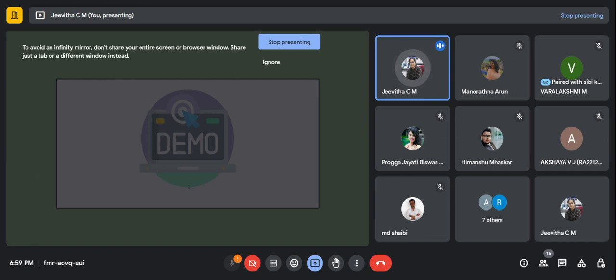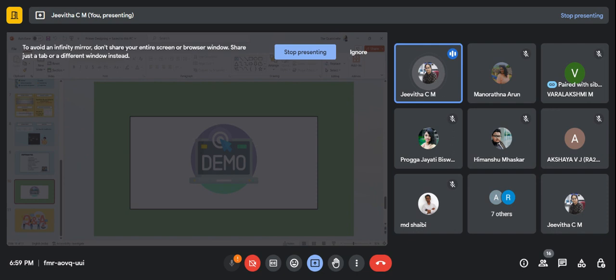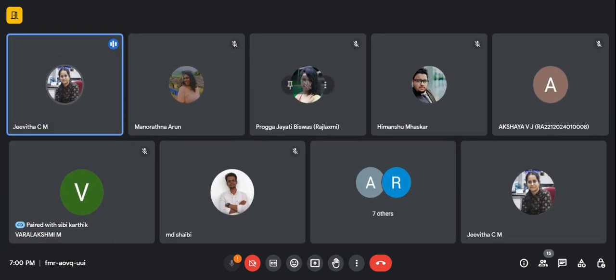So till now, if you are having any doubts, we can first do our demo session. I'll be taking some sequences from NCBI, and I'll be showing you how it works. After that, we can have a Q&A session, where you can ask whatever doubts you have. If you're all okay, and whoever is attending the classes on a laptop, you can also do your primer designing alongside, and I'll be teaching how to perform it. So if you're all okay, I'll begin with the demo session.